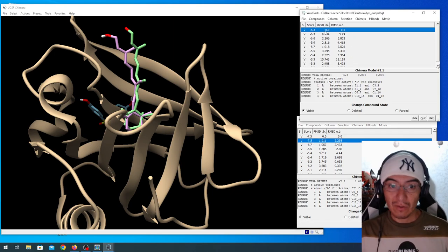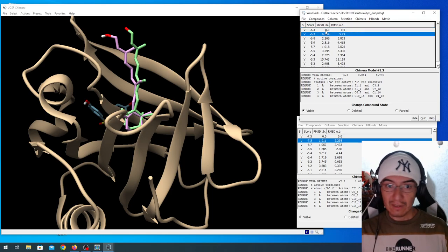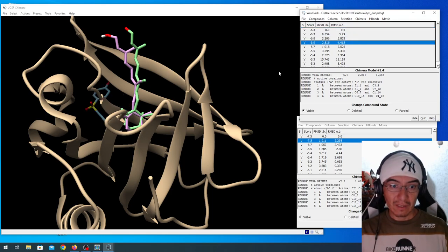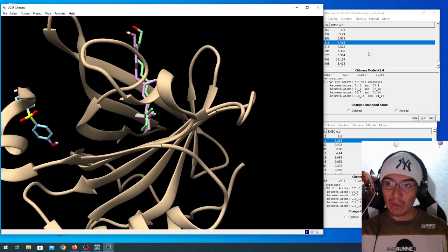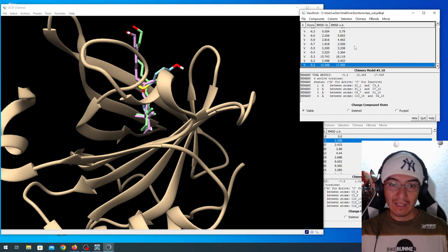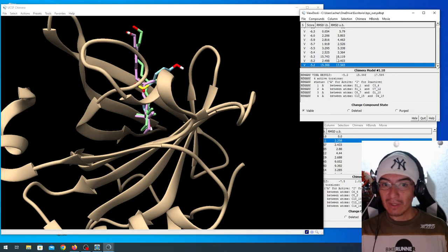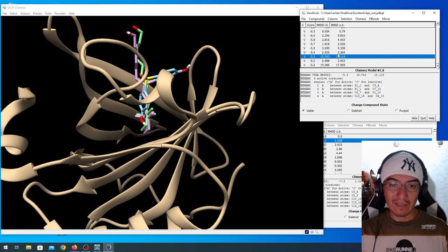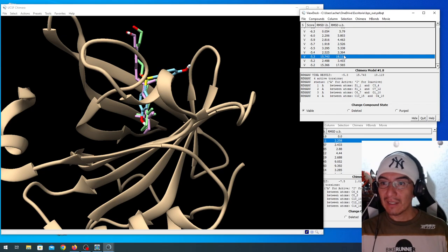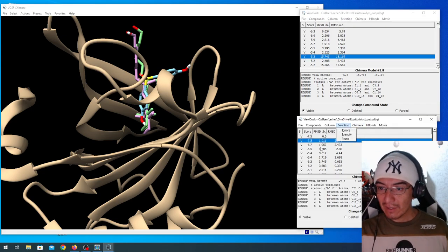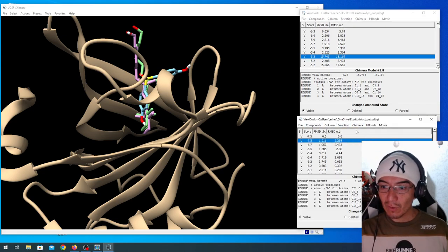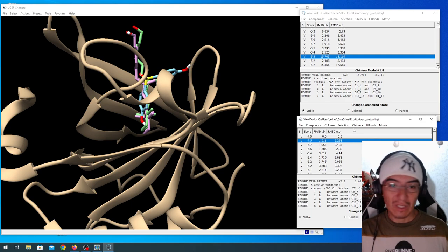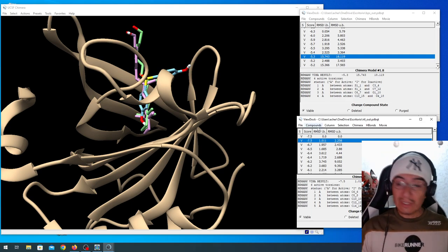BPS, on the other hand, is not on the binding site, but in an exterior site. Oh, actually, there's a couple of cases where it's located in the binding site. Lower energy, at least 2 kcal from the retinoic acid. And here you go.